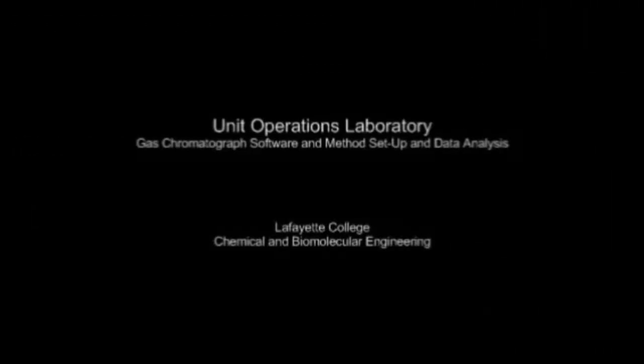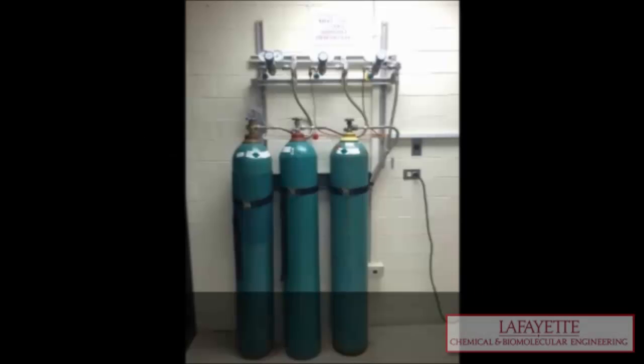This video demonstrates the software setup and data analysis procedure with respect to the Agilent gas chromatograph in the Unit Operations Laboratory at Lafayette College. When using the GC, proper safety precautions should be taken.